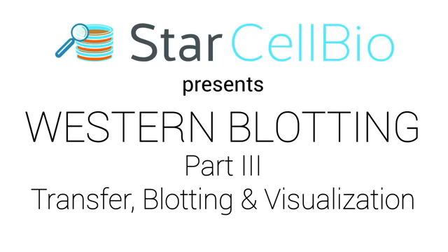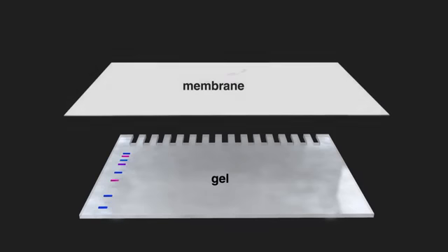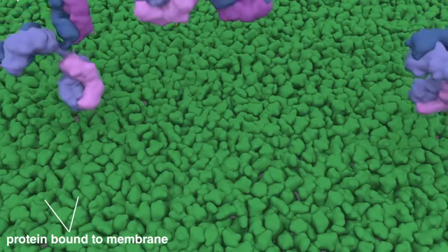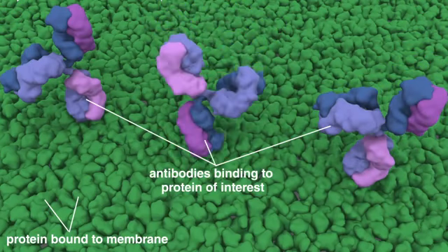Western Blotting Part 3, Transfer, Blotting, and Visualization. To process the gel further for the detection and visualization of specific proteins and/or molecules, the proteins are transferred from the gel onto a more durable material that can be manipulated and blotted with antibodies of interest. Transferring is necessary to allow antibodies free access to proteins and because polyacrylamide gels are fragile and difficult to manipulate.